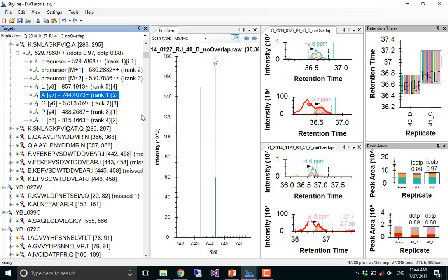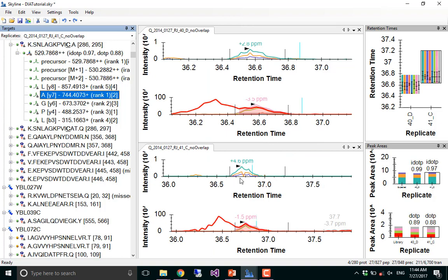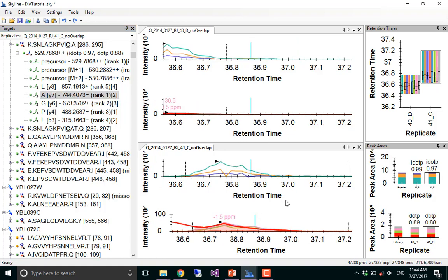If I had left this transition in, another thing I wanted to show people is looking at this MS1. Do you see anything weird about this MS1 up here? Yeah, this right here, right? Okay, so I want people to try to figure out what's happening. Does anybody have a hypothesis of what could cause that? Yeah, who said that? Mass error.